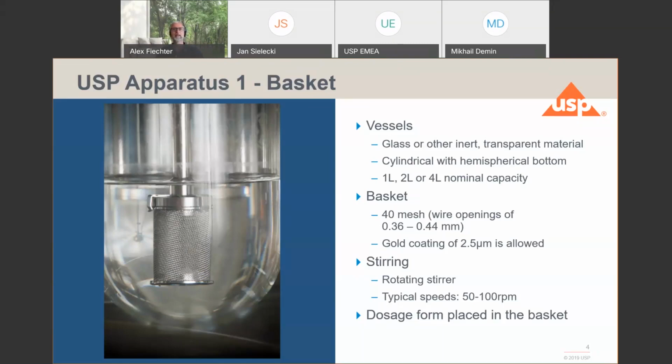But if stainless steel is an issue, gold coating will be accepted by the general chapter as well. The stirring for the typical tests is given from the rotating stir motor assembly. On top of all that, we know of test procedures in monographs that typically have 50 to 100 RPM.